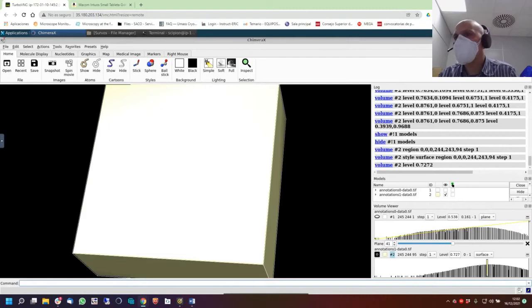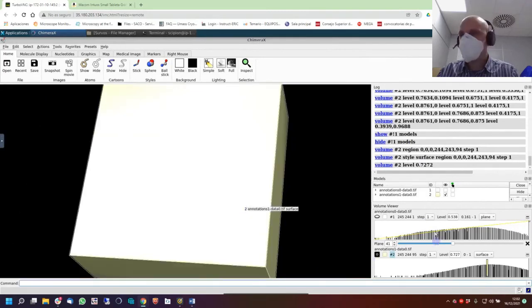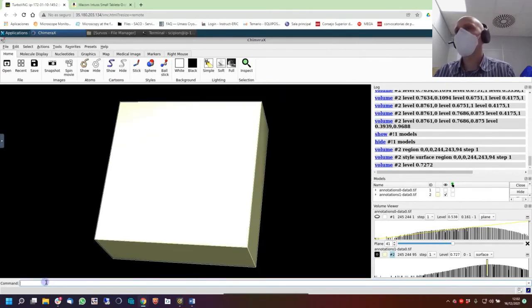Up both faces. Let me show. Because now in the other stuff, the old one is just a menu here. But I thought it's there. I forget. Show cap. Cap. Damn it.